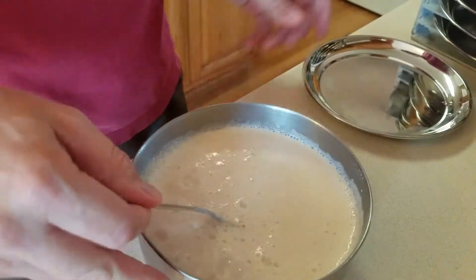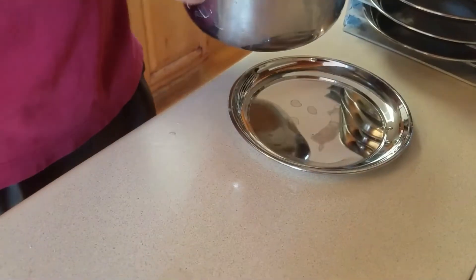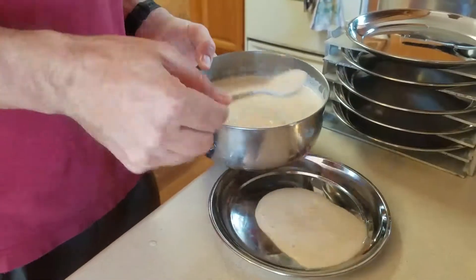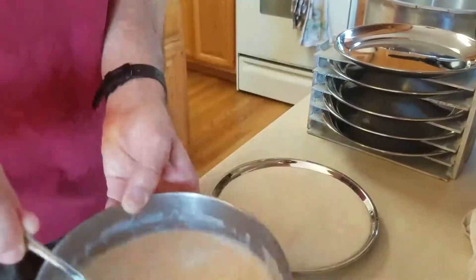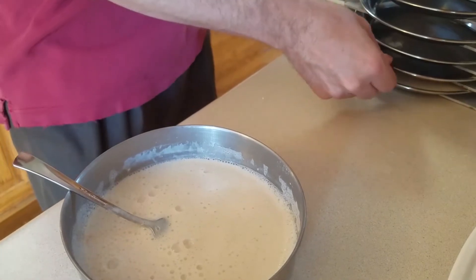We want to get it about a half an inch thick on the trays. We don't want it too thick because if it's too thick, it's going to take longer to freeze dry. Put that right in there, and then we'll proceed with the next one.